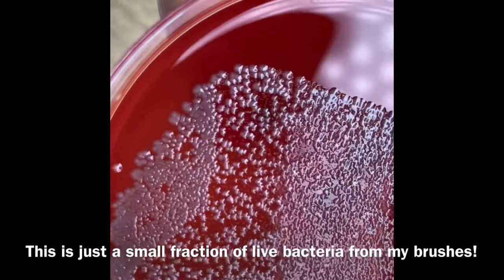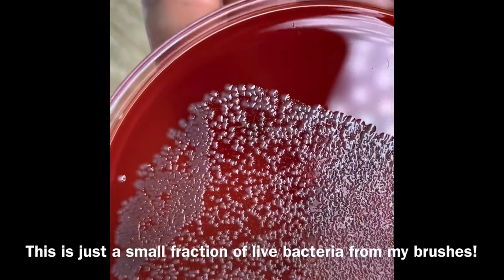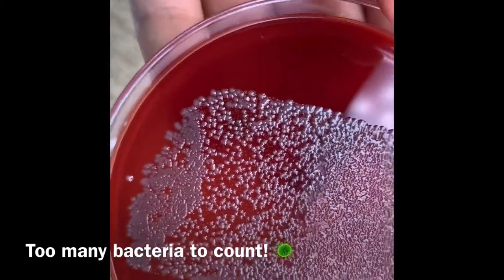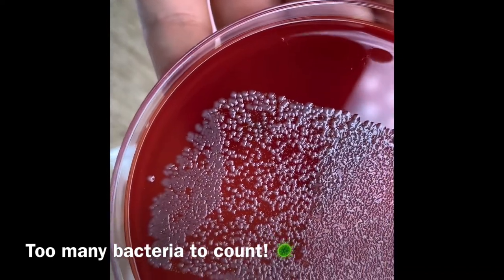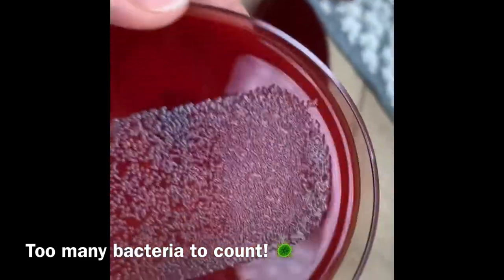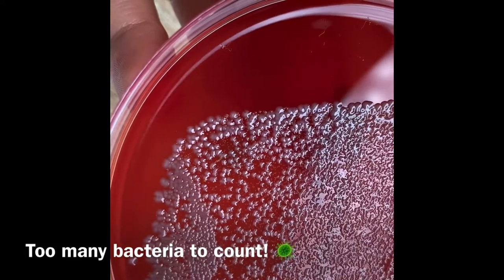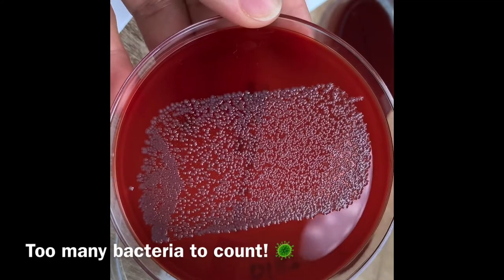In the background you'll see even tinier dots — more bacteria growing. Different bacteria grow at different paces; some cells require more time before they start multiplying. Some, like the larger ones on top, can grow very quickly, like in 24 hours. This has been almost 48 hours. Those little yellowish-brownish ones require more time. If we had to count, it's definitely more than a thousand different cells.